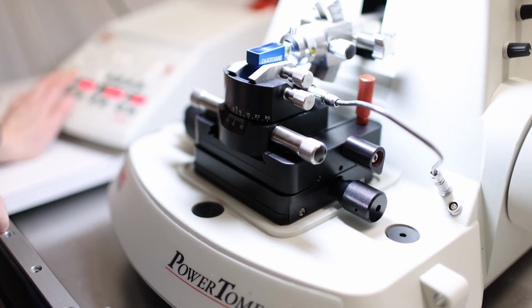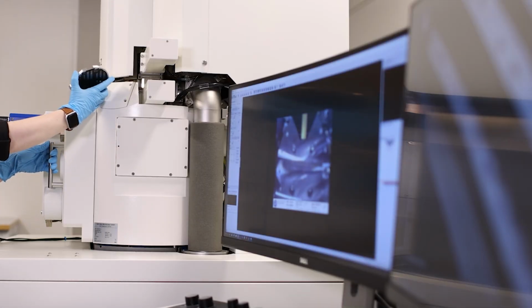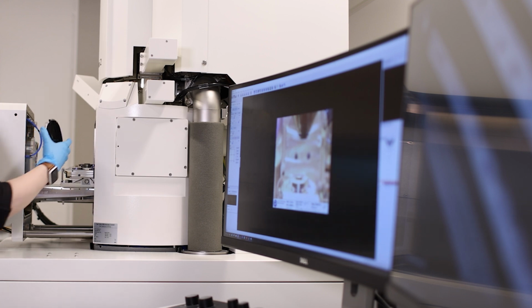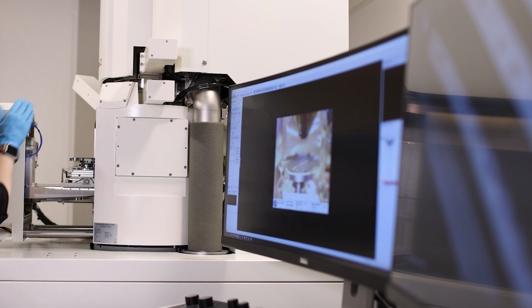I think that nowadays this has evolved a lot. It has proved to be a very valuable technique for many different modalities or specialties in science. And I think the most valuable part is this idea that you can combine the benefits of different modalities, because you have this holistic view when you put them together. That means it's extremely valuable not only in neuroscience and cell biology, but also nowadays we are moving into a lot of studies in developmental biology, where we try to see the fate of the different cell types and how they evolve and change within tissue.